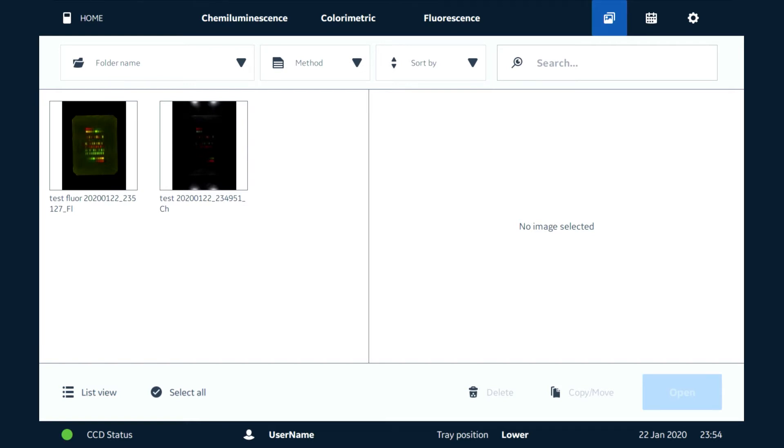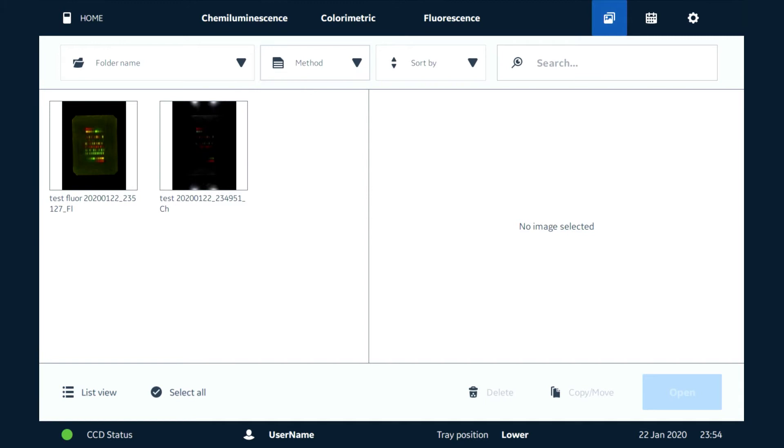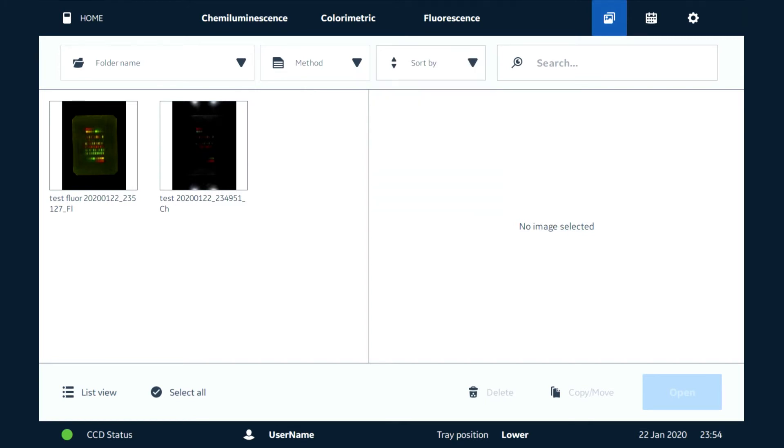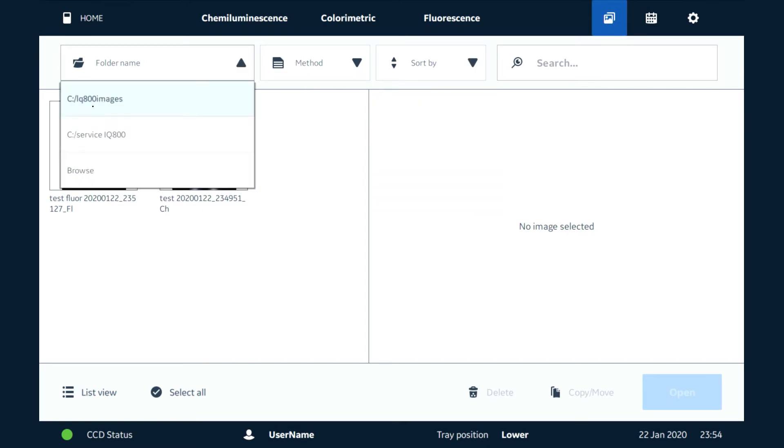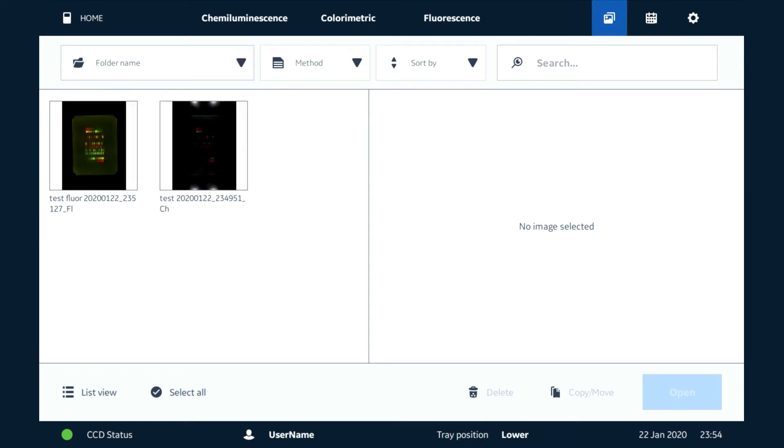We can now search in here by method. We have the option to sort by date. We can also search different folders on the system or on a network.